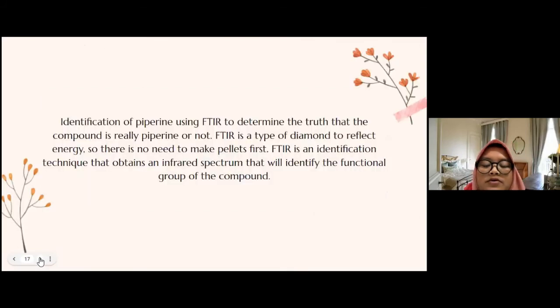Identification of piperine using FTIR is to determine the truth that the compound is really piperine or not. FTIR uses a diamond to reflect energy, so there is no need to make pellets first. FTIR is an identification technique that obtains an infrared spectrum that will identify the functional groups of the compound.